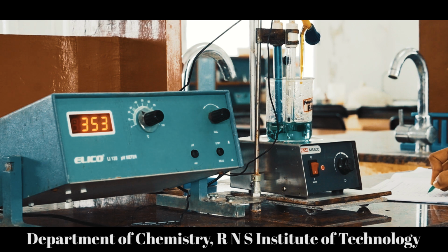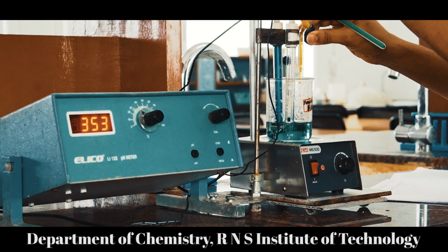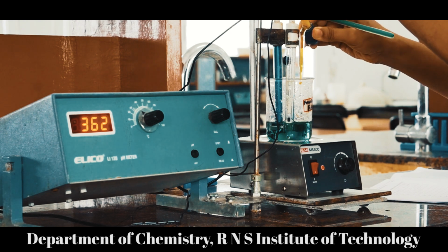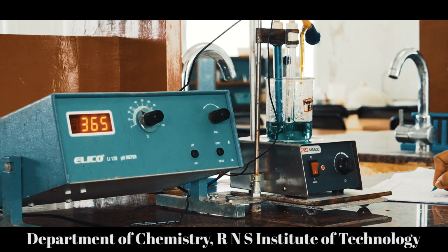Note down these potential values for every 0.5 ml of potassium dichromate solution. At one point you will observe the jump in the value. That potential jump is noted.